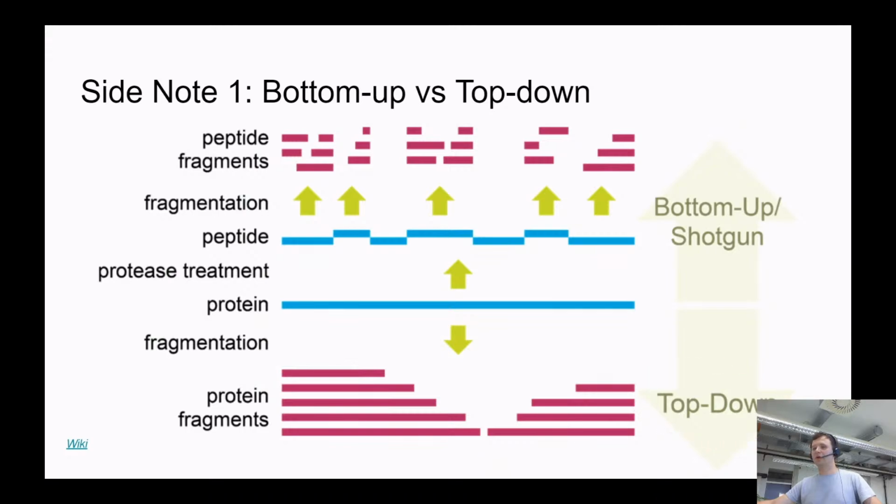Top-down proteomics is a very cool thing, but up to modern standards, we can analyze only very low complexity mixtures. We can analyze a mixture of 5 proteins. That's what we can actually do, what many pharmaceutical companies do, but not more, unfortunately. And you have to also keep in mind that top-down proteomics has very strict requirements for the instrumentation.